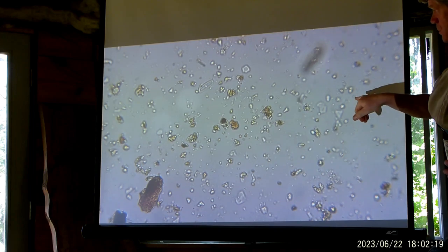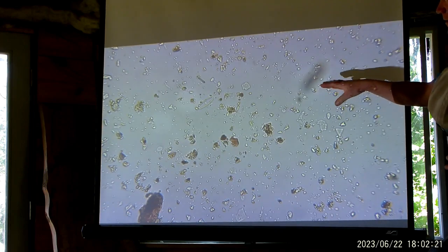What you can do, though, is that bacteria tend to be symmetrical, and you're either going to have dots or rods, as opposed to all the soil bits that are erratic. And most organisms have some symmetry to them, as opposed to plant material and mineral material.